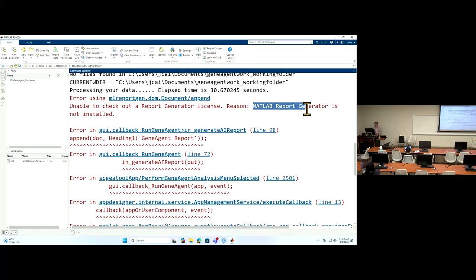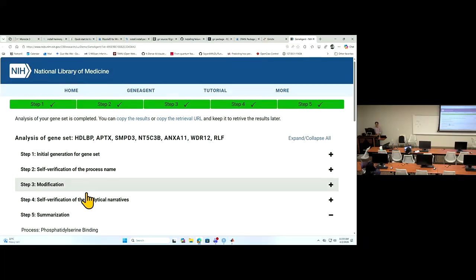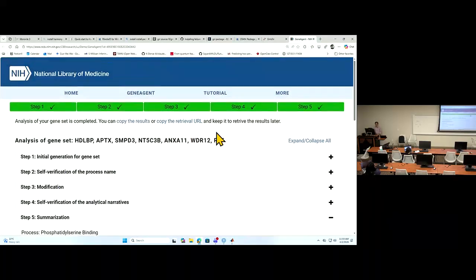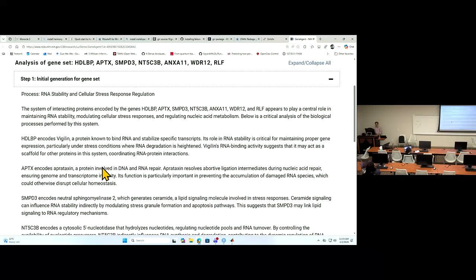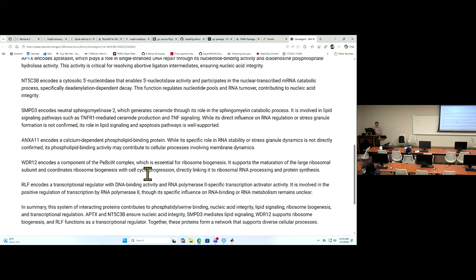Yeah, so I do have code which relies on the MATLAB Report Generator to read this information back and generate a Word document. But you don't really need that part, because it's already very thorough and gives you the report for every step. Okay?